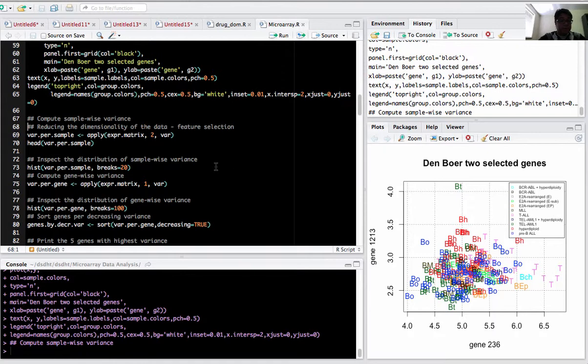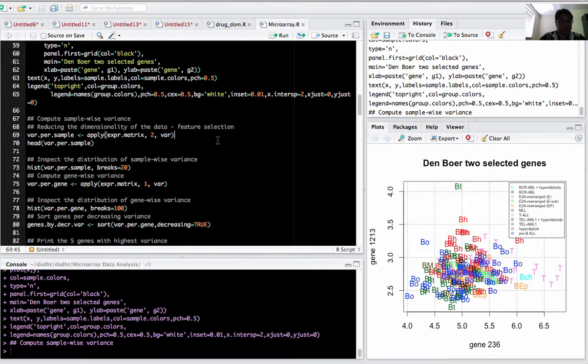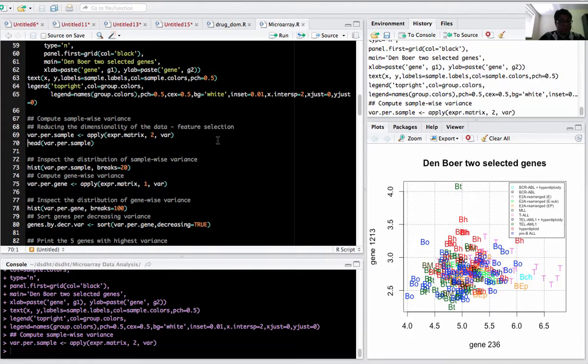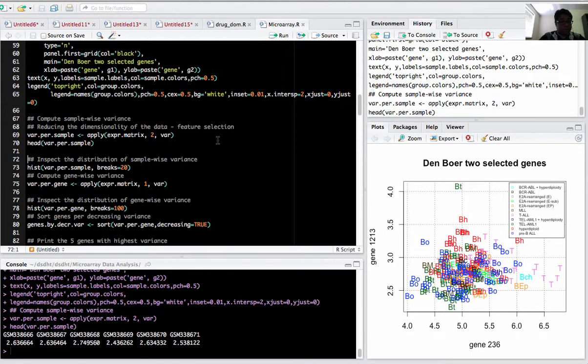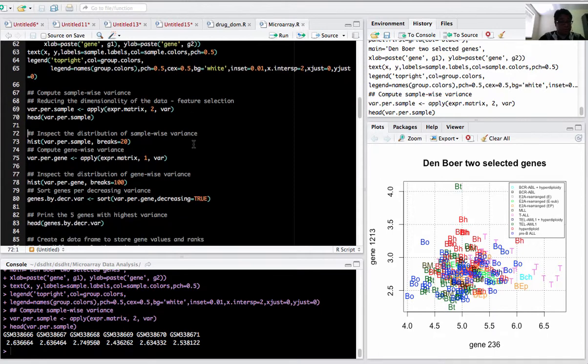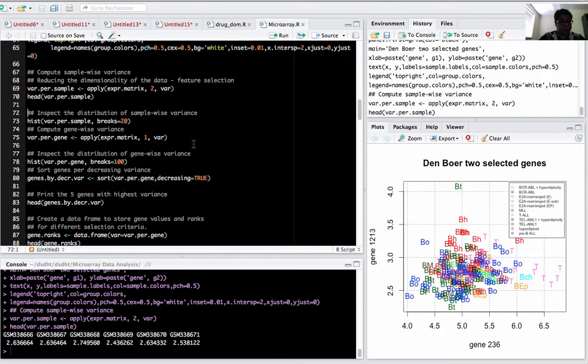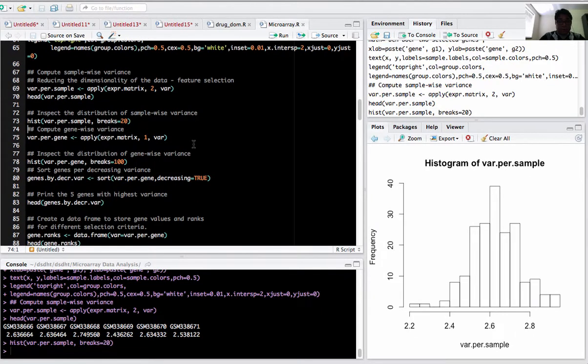We'll be reducing the data using the feature selection technique, using the variance filter. Using the apply function, 2 indicates we'll be using variance for all the columns. If it's 1, we'll be using it for rows. Applying variance per column, you can see GSM38 has maximum variance. Plotting the histogram of the variance, you can see it's kind of normally distributed.